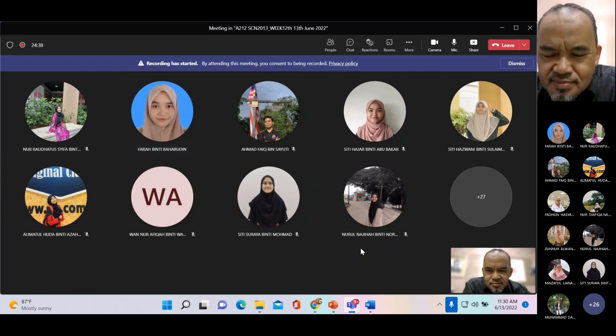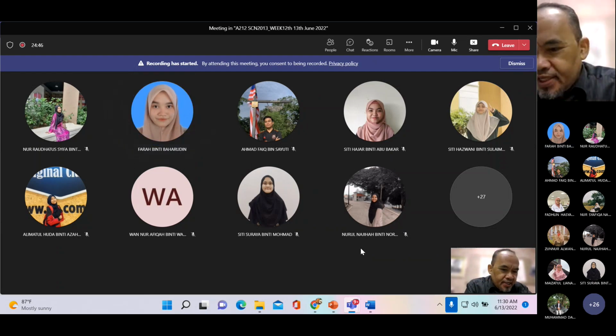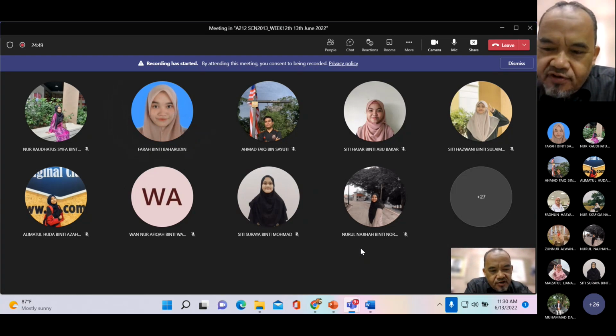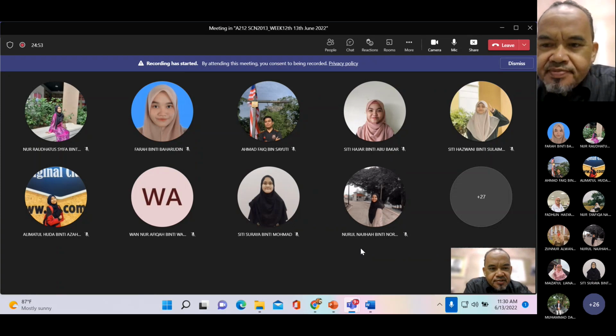But you did notice one thing just now, the mirror image. The mirror image actually could be one of the characteristics of fluorescence. Mirror image between the absorption and also the emission. Okay, thank you, Farah. Is there any other observations?